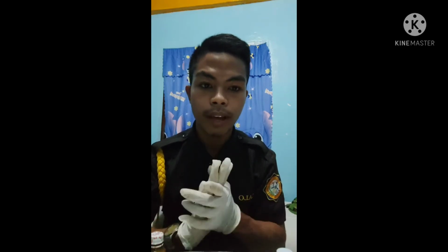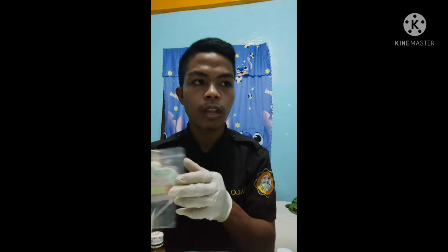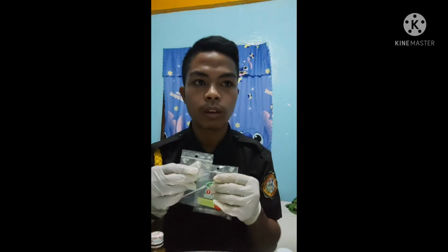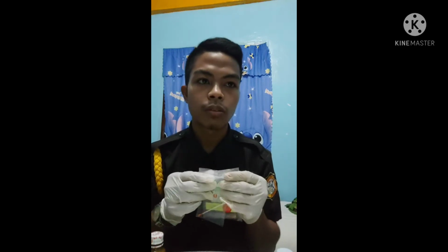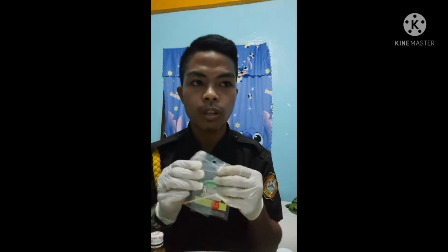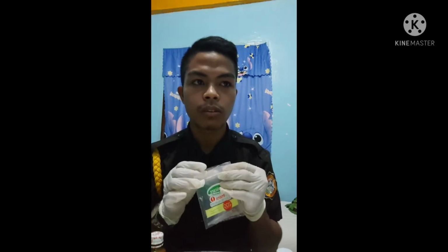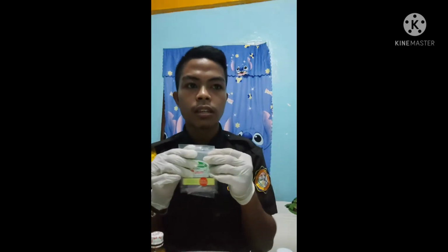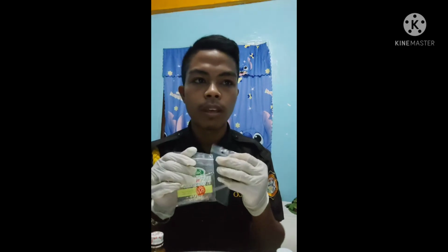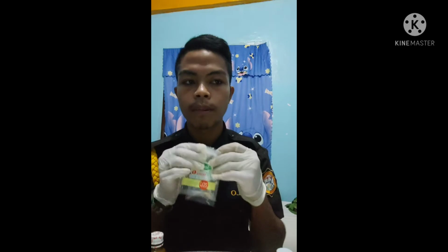I have the two samples that I collected earlier because we are using two types of preliminary test later, which are the Benzidine test and the Phenolphthalein test. They are already sealed and labeled so that they will not be mixed with another substance, will not be contaminated, and will be preserved.